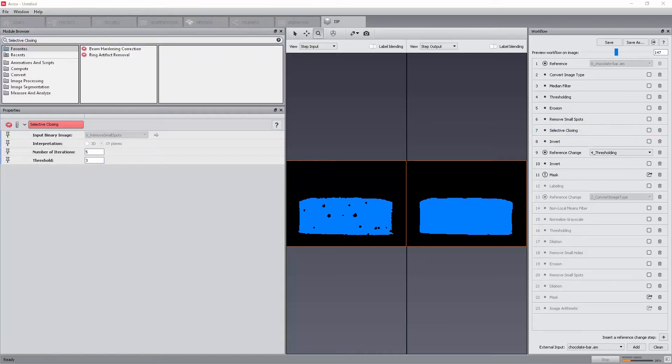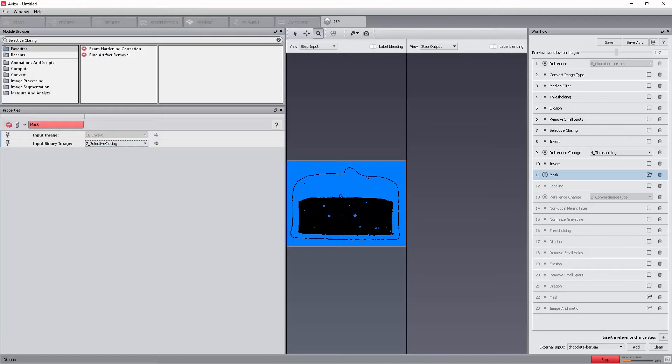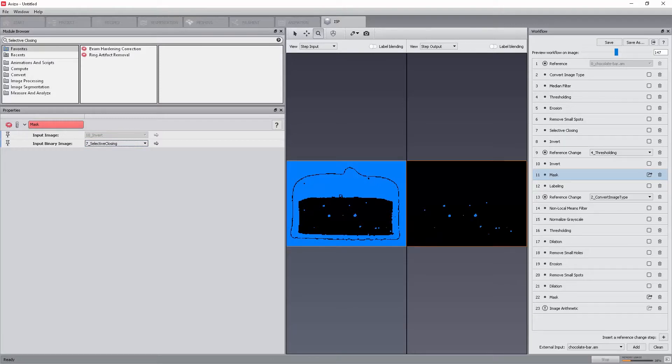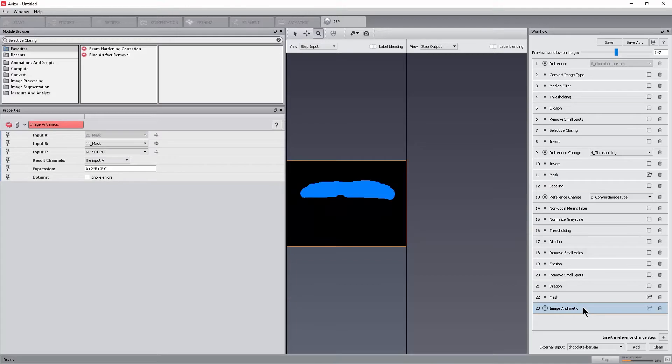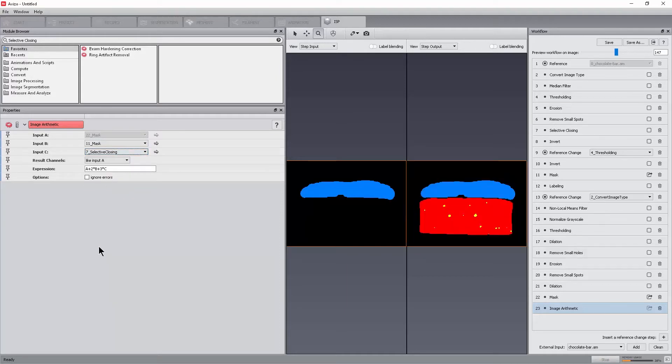Click the mask step where the error appears and then set the selective closing output as a binary image. The workflow is almost fixed. There is still an error at the last step image arithmetic. Select this step and set the input C port correctly. The workflow is now fixed.